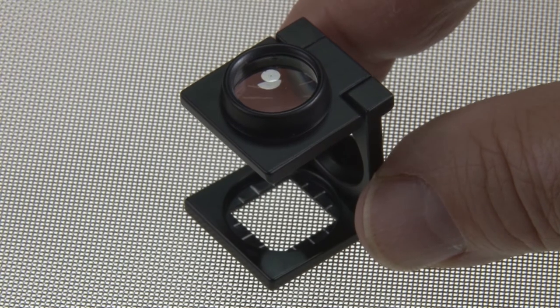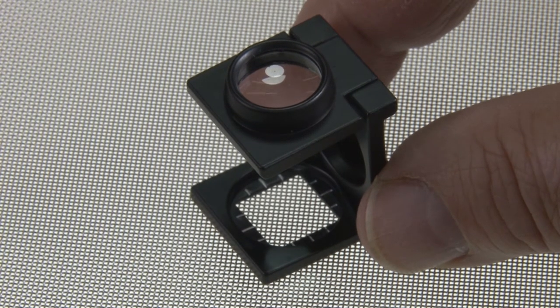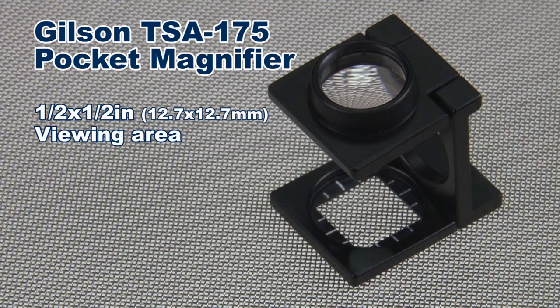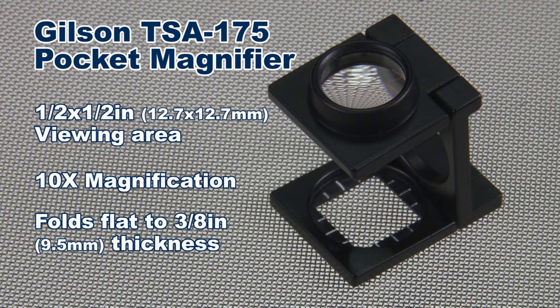The Gilson pocket magnifier examines wire cloth for damage or approximation of mesh opening size. This rugged magnifier has a half-inch square viewing area with guide marks and 10 times magnification. The unit easily folds to a compact 3-inch tool that can be stowed anywhere.